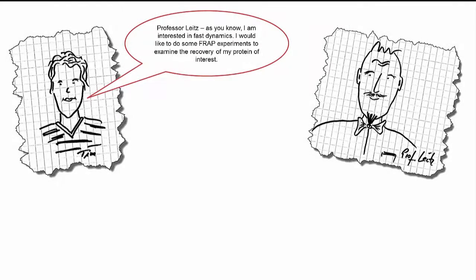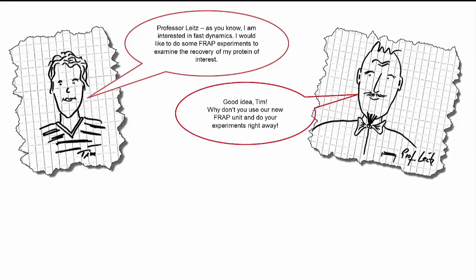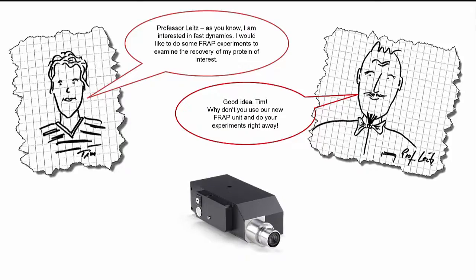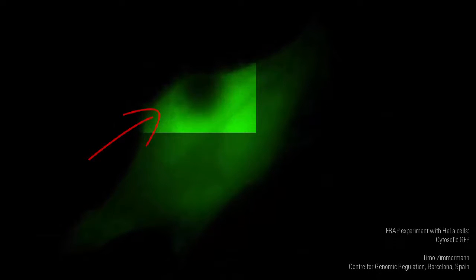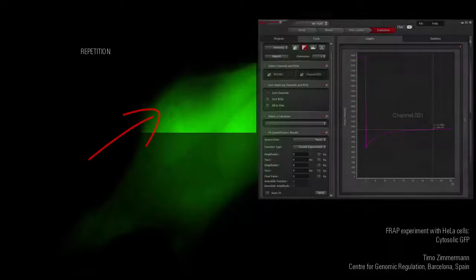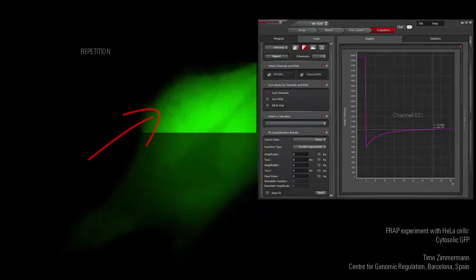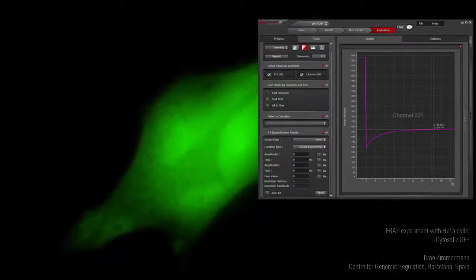Professor Leitz, as you know, I'm interested in fast dynamics. I would like to do some FRAP experiments to examine the recovery of my protein of interest. Hey, good idea Tim. Why don't you use our new FRAP unit and do your experiments right away? This is a FRAP experiment with the cytosolic GFP-stained HeLa cells. With the wide-field FRAP module and software wizard in Leica LASX software, setting up and running FRAP experiments is simple and fast, generating FRAP recovery curves for further analysis.